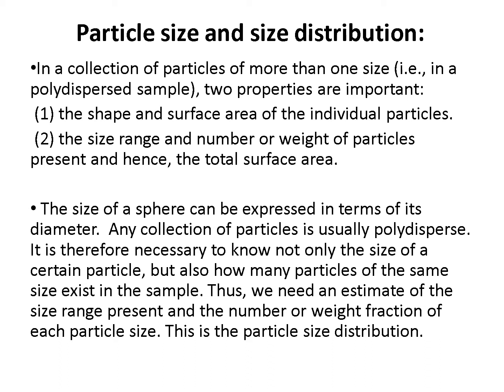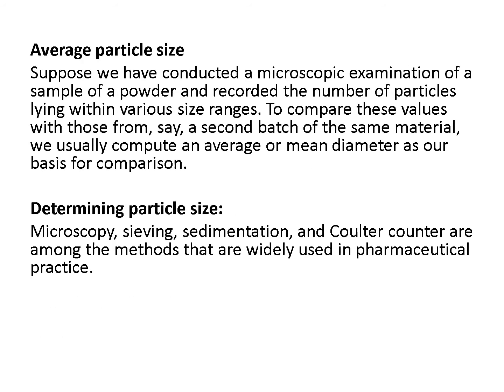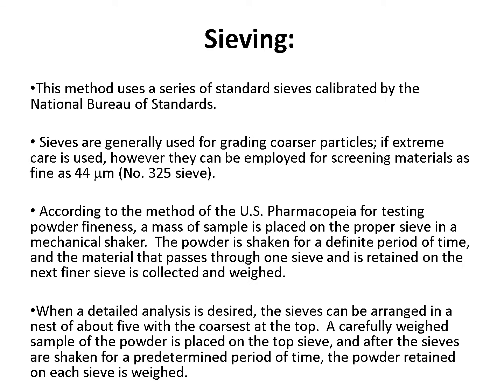There are different techniques usually used in determination of particle size and particle size distribution. One of them is using sieving, as we will do in our lab. But another technique which is really easy is to mount a little amount of the sample on a glass slide with water or oil, put it under the microscope, and measure the diameter of the powders inside.